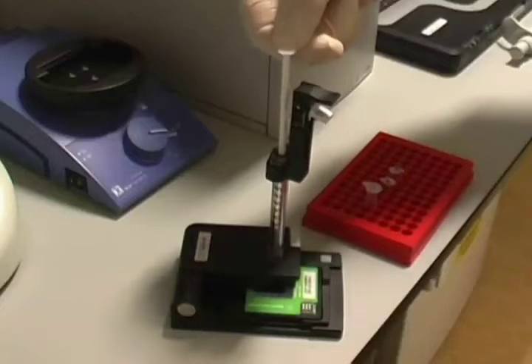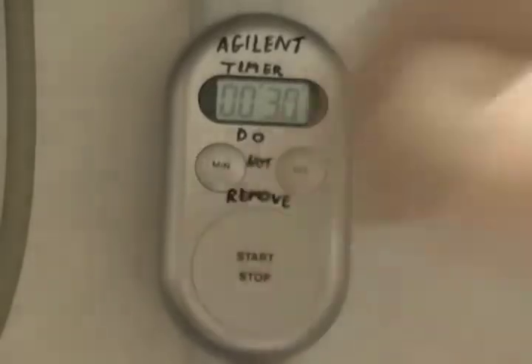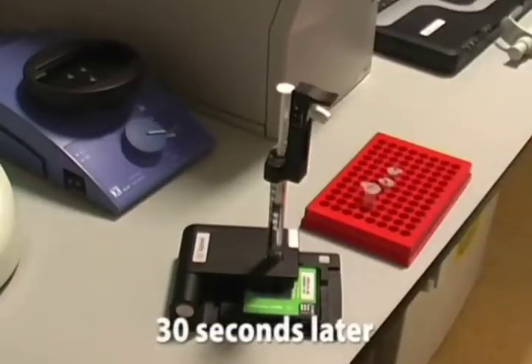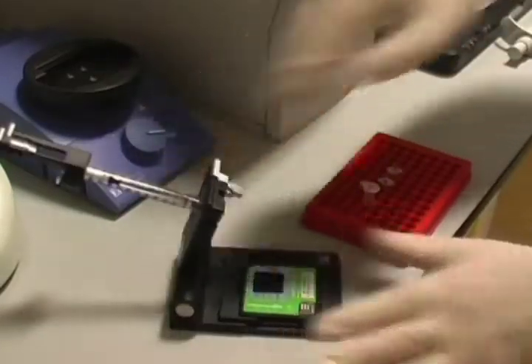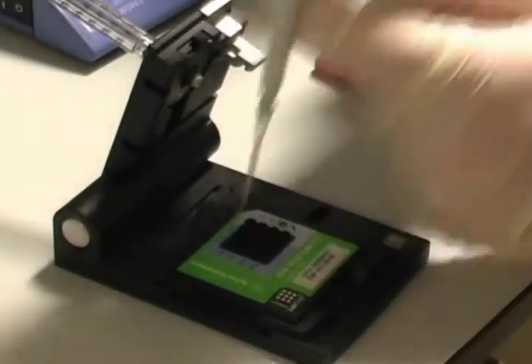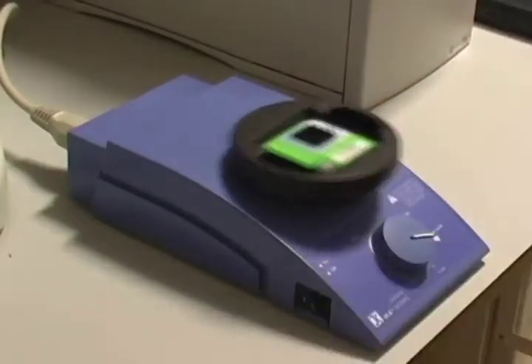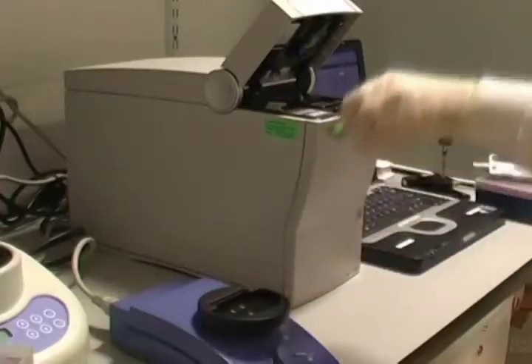Pressure is applied for 30 seconds. The RNA samples are then added to the chip, which is mixed before being placed in the bioanalyzer.